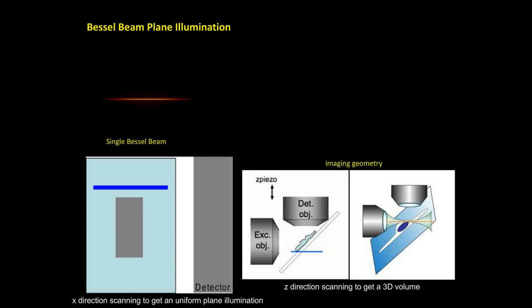So with this pattern, we can create a specific frequency pattern. We can use the galvo mirror, which will step on and off, on and off, to create some frequency on the excitation. This is what we call Bessel beam super resolution by structured illumination. If you look at the Bessel function and use a galvo to step on and off, we can create the Bessel SI, structured illumination excitation.